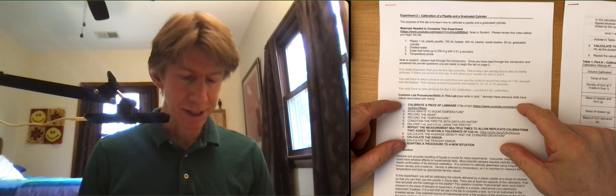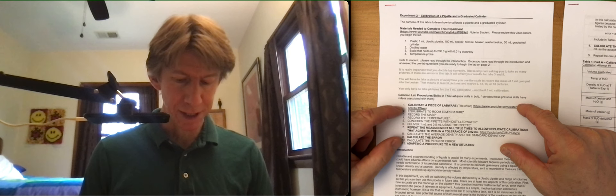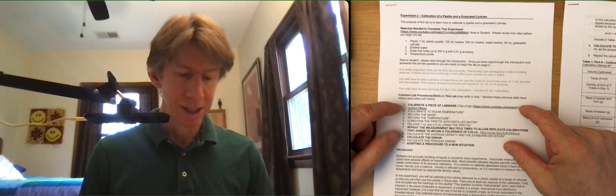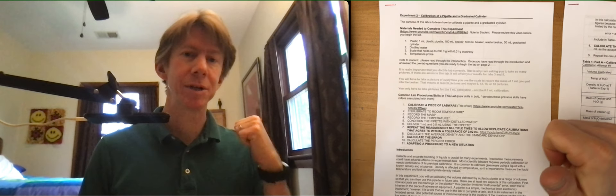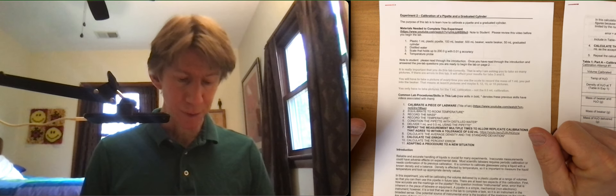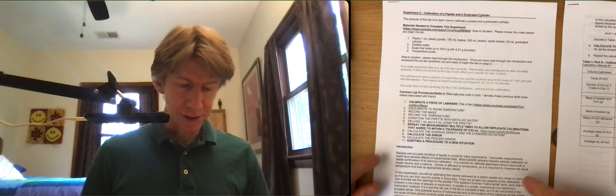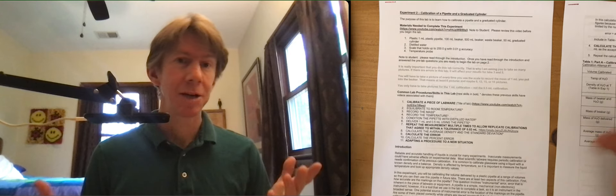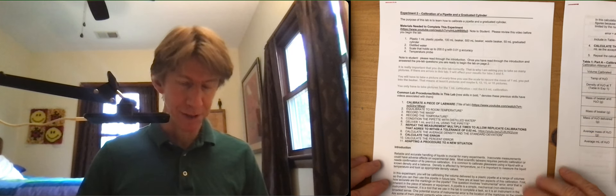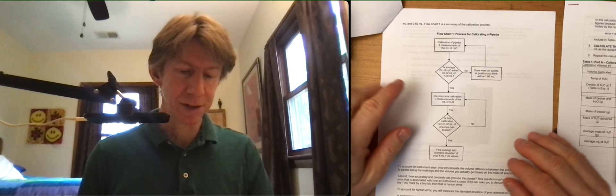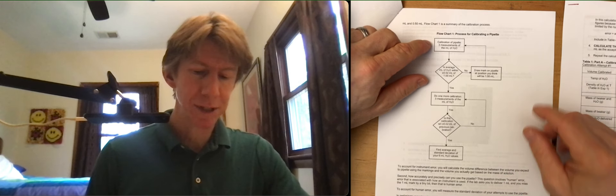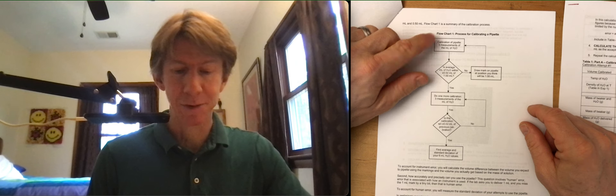Here's the skills that we're going to be learning, some of which have videos that are associated with this lab. A bunch of these have videos that are associated with the previous lab experiment one. The introduction talks about the reliable and accurate handling of liquids which is critical for chemists, biologists and so many people. Please read over this but we're going to go over this flowchart because we're going to be calibrating the pipette. That's what the flowchart's for.